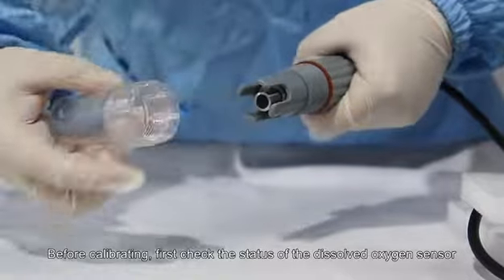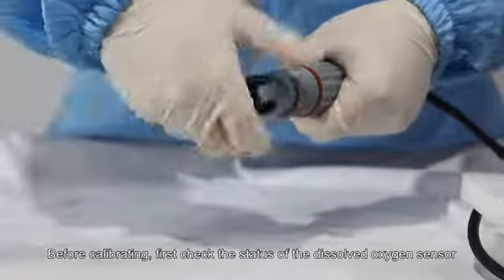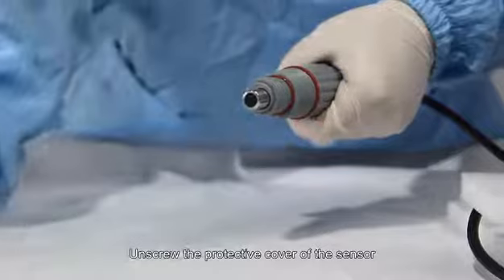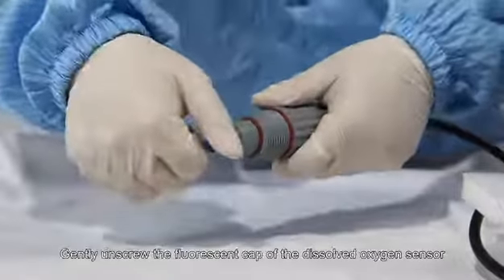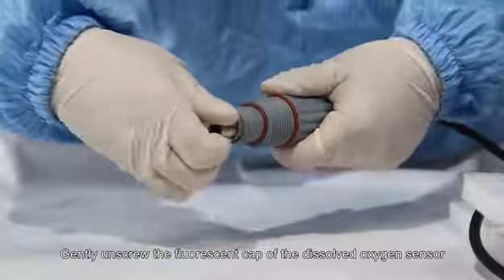Before calibrating, first check the status of the dissolved oxygen sensor. Unscrew the protective cover of the sensor. Gently unscrew the fluorescent cap of the dissolved oxygen sensor.